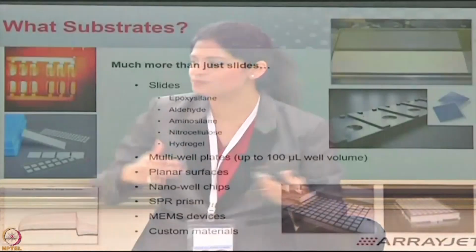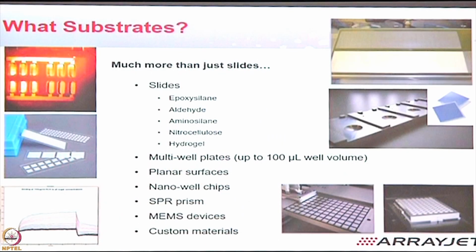In this plate, there is one well. Your entire one ELISA can happen in one well. Instead of a 96 well ELISA plate for one reaction, that one plate can all get condensed into just one small tiny well. So you can see that we can not only print onto wells, but onto plates, onto biochips. Majority of the work, I'll tell you, is on slides, to be very honest.